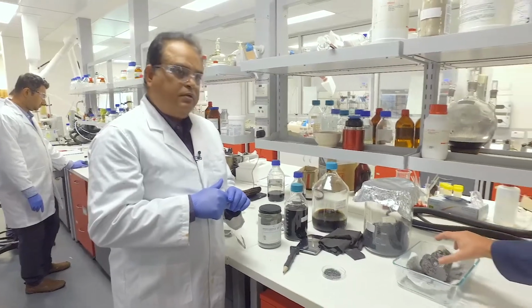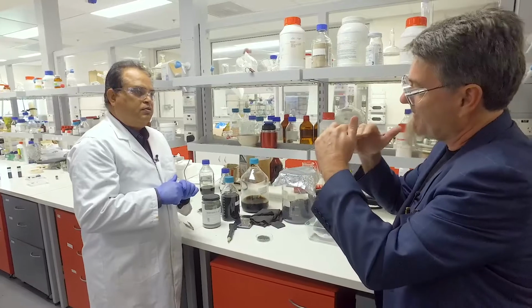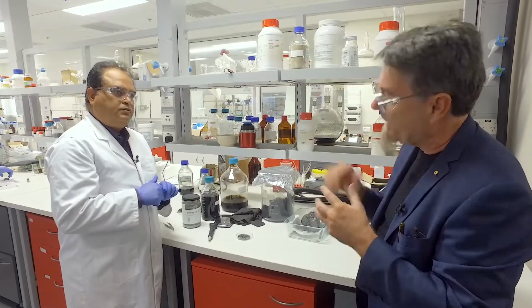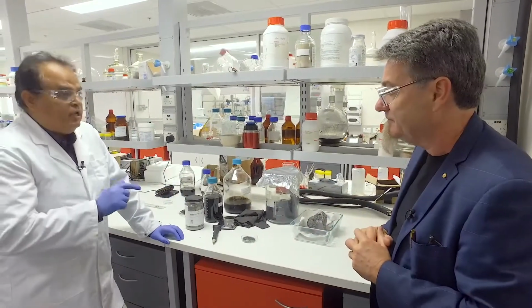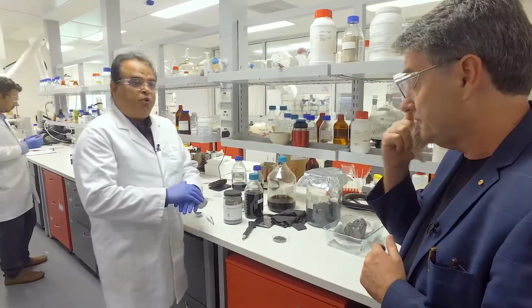So we take this lump of graphite, we grind it into flakes, and then those flakes have multiple sheets of graphene. Absolutely. And you're putting ions in between those sheets of graphene. Absolutely. Right. The next step would be? Then we give a rapid thermal shock to this material, so that it pops like popcorn.